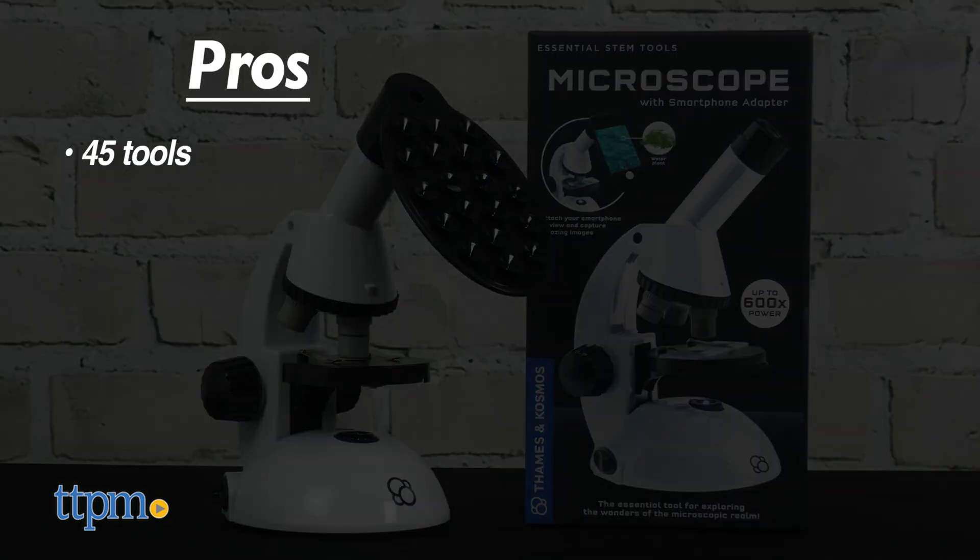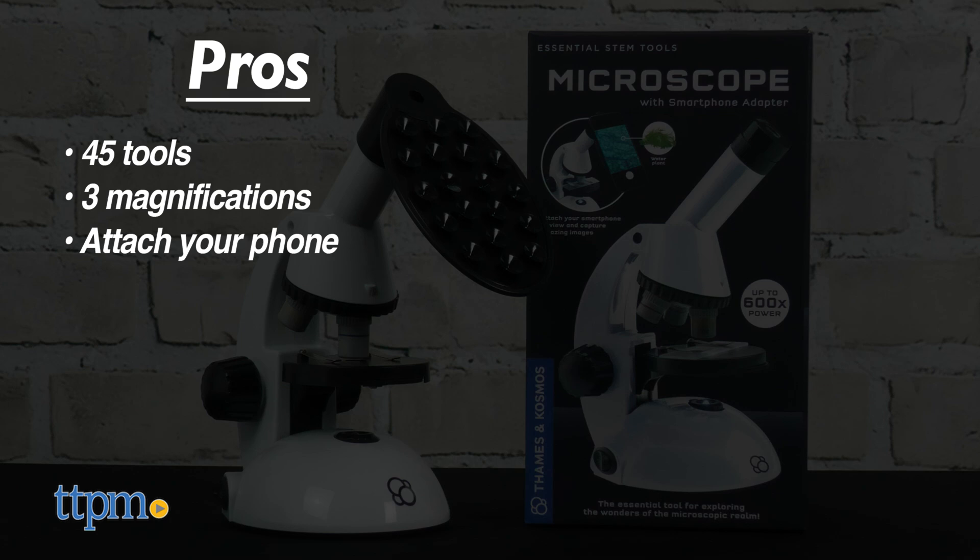The pros: it comes with 45 tools, has three magnifications, you can attach your phone and take pictures of what you see, and it introduces an essential STEM tool to kids.